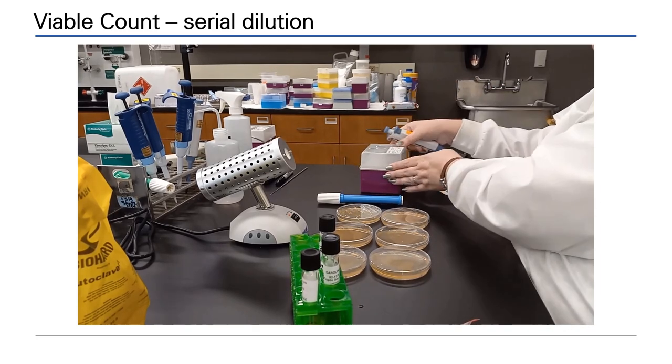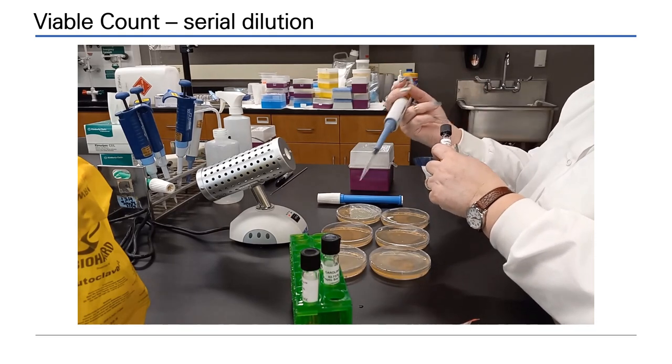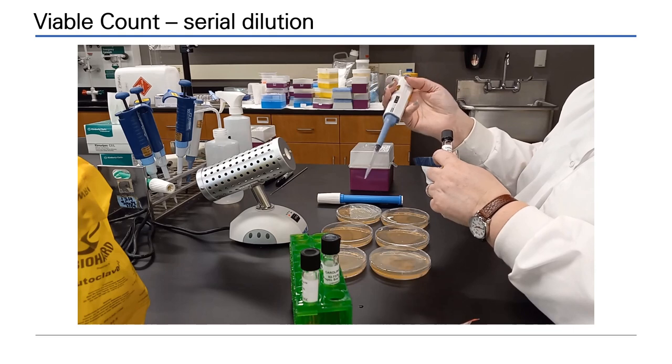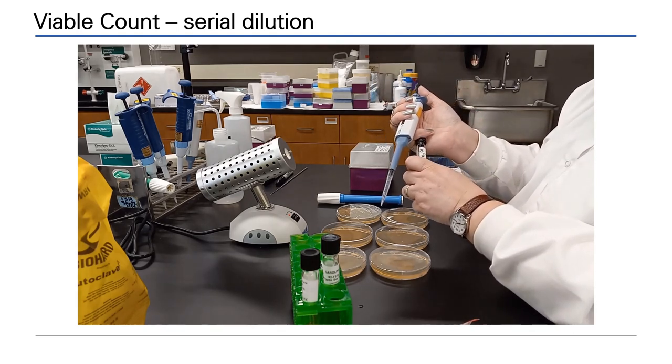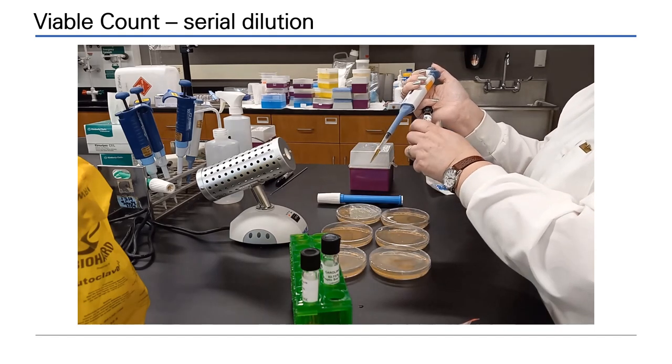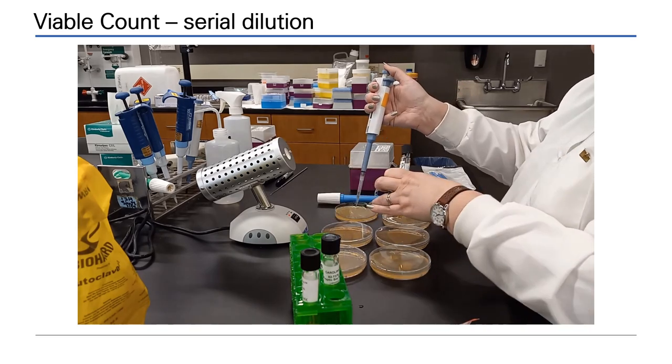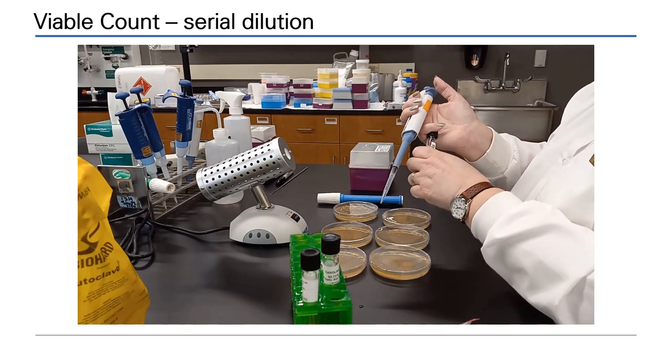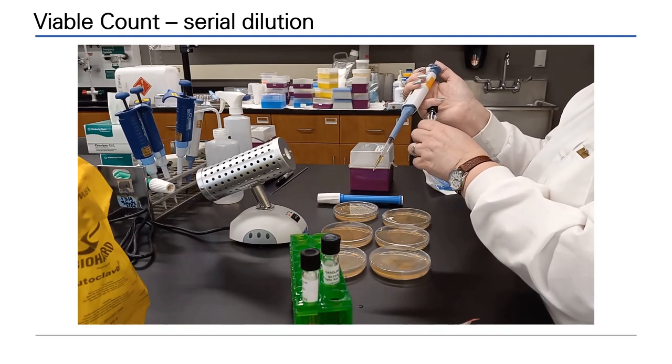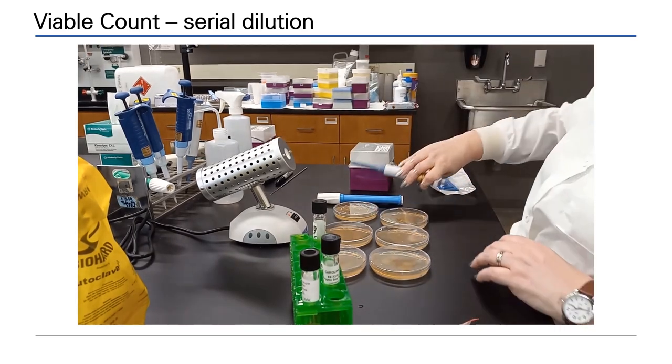We do not plate the whole dilution, just a portion of it. Here, we're going to plate half a ml. We can plate any volume as long as we know what it is and we are consistent. And then we can recalculate the dilution from the tube. Remove the half ml sample. Work aseptically. Transfer the sample by dropping it onto the surface of the agar. Repeat this for the duplicate plate. Notice that we're working from the lowest concentration, moving up to the highest concentration. Use a clean sterile tip each time.